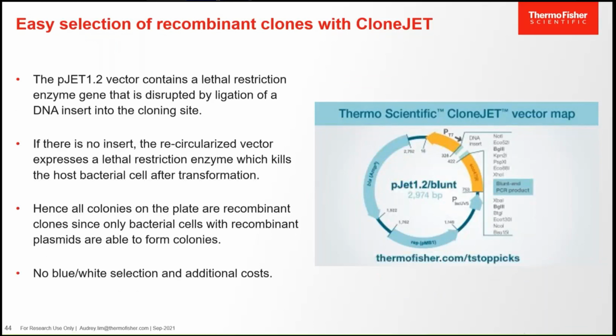But unlike blue-white screening, where the cloning site is within the lacZ gene, in CloneJET the multiple cloning site is within a lethal eco47IR gene. This means when the vector recircularizes, it will express this lethal restriction enzyme gene, which will kill the host bacteria after the transformation.